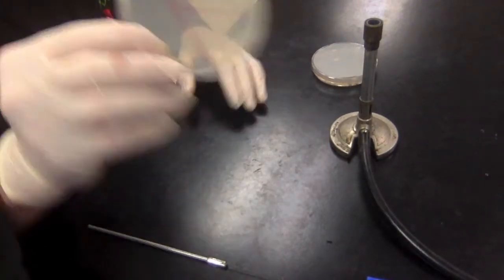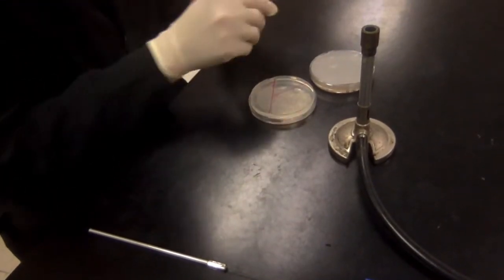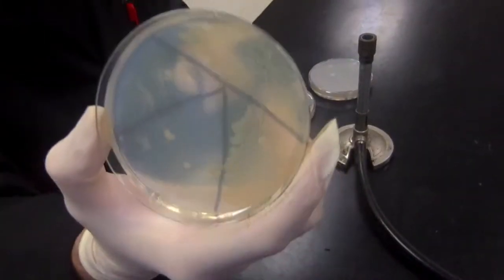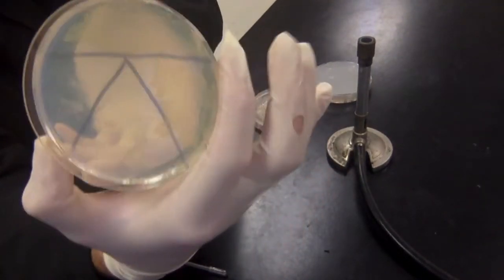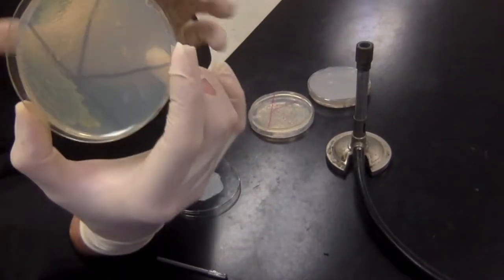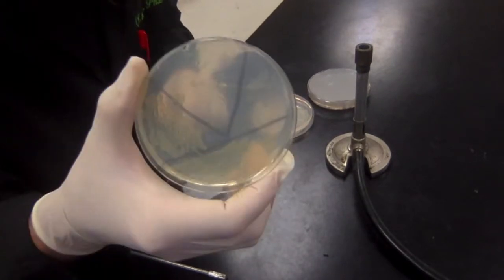Our plate has been streaked out. We'll put it in the incubator, and what we can expect is that tomorrow we'll have something that looks more or less like this example. You can see growth is very thick in the first sector, less thick in the next, then just a few individual colonies, and in the very final sector there's no growth at all — we've sequentially diluted the culture until we get individual colonies.